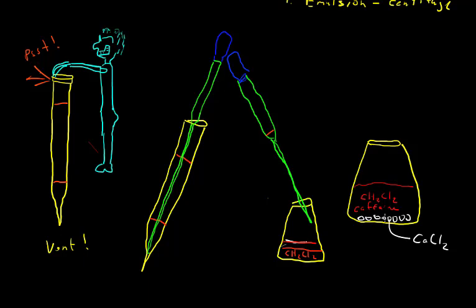You pour this off. If you have a difficult time doing that, you can get a clean Pasteur pipette and just draw it out that way, but you want to leave the calcium chloride pellets behind. One thing that I should mention about the calcium chloride, it is anhydrous. It does pull moisture out of the air, so make sure that you seal up the bottle of calcium chloride pellets when it's not in use. So once you've poured these out, please make sure that the bottle is sealed so that the remaining calcium chloride does not get hydrated.